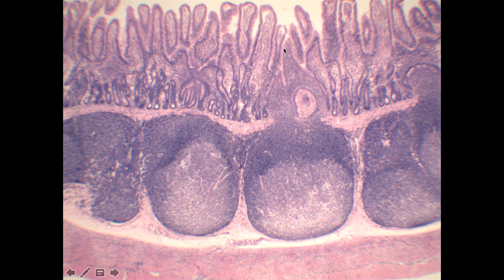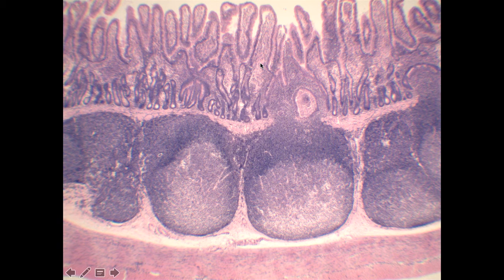Remember: if you see villi — these finger-like projections — you know you're in the small intestine. The next step is to look for the two defining features: either the Peyer's patches, as we see here, or the Brunner's glands, which we see in the duodenum.